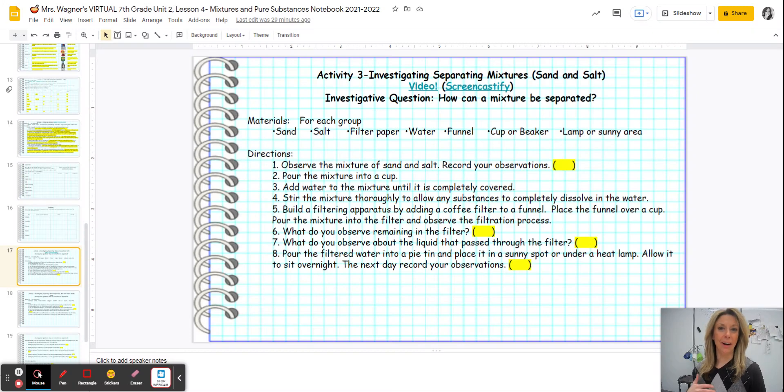All right, Mrs. Wagner here. We are back on activity three. This is investigating separating mixtures, sand and salt. This is part two.